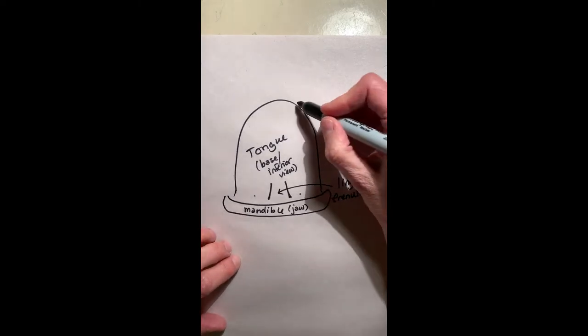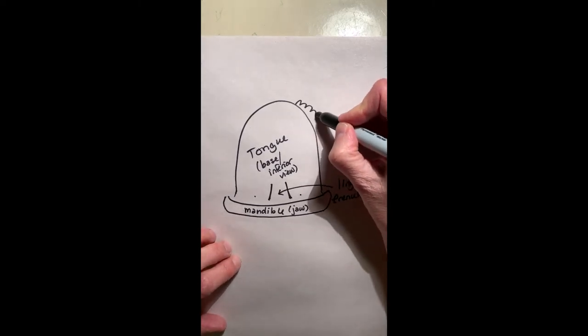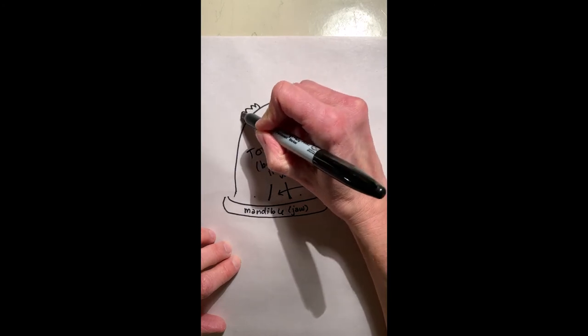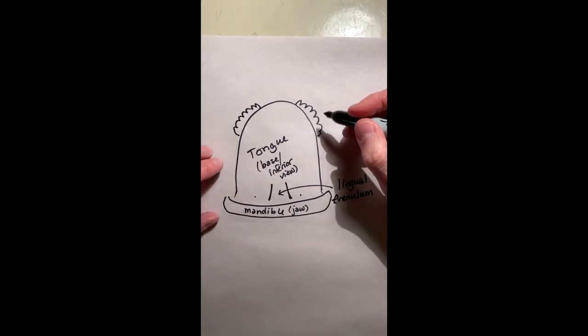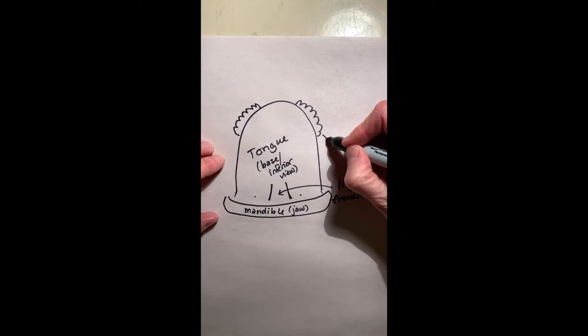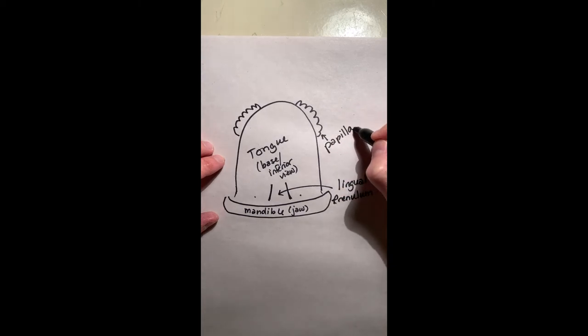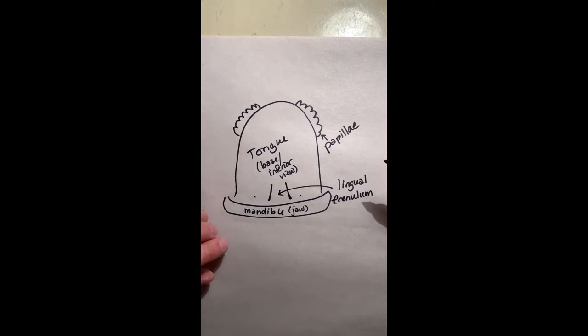Another thing we can see on the tongue fairly easily on the fetal pig are these tufts that stick off the furthermost or the most distal part of the tongue, the part that's sticking out of the mouth essentially. These tufts are called papillae, very similar to the papillae that are on the tongue itself, where you find the taste buds in between.